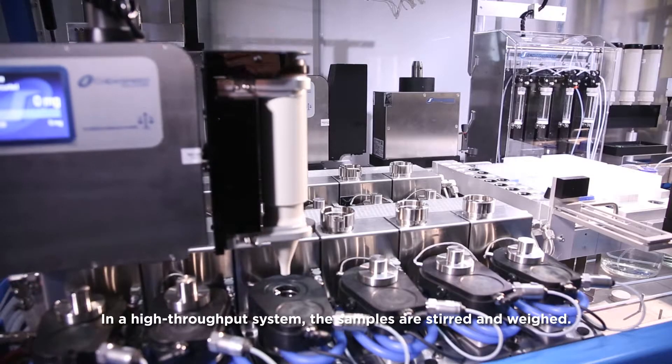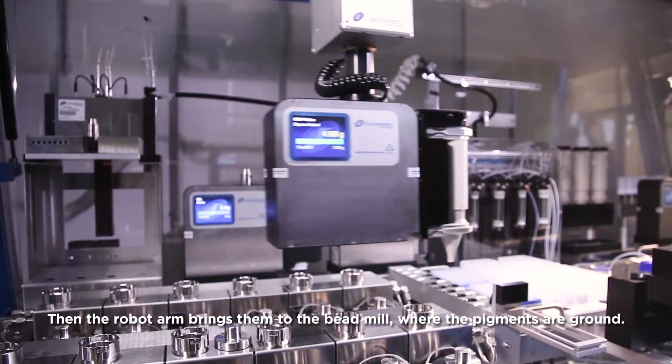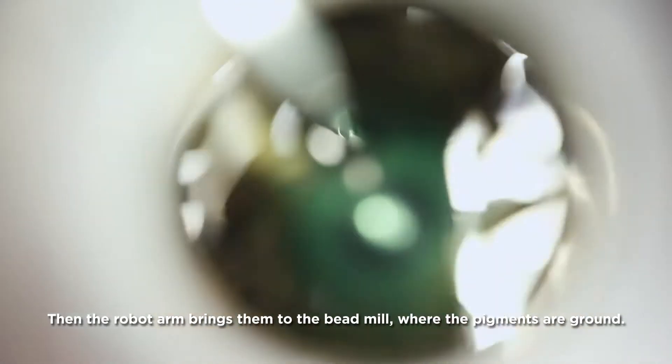In a high-throughput system, the samples are stirred and weighed. Then the robot arm brings them to the bead mill, where the pigments are ground.